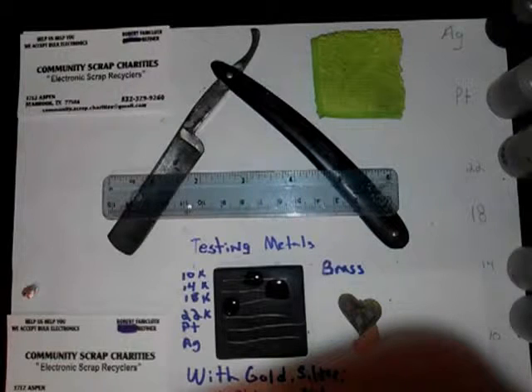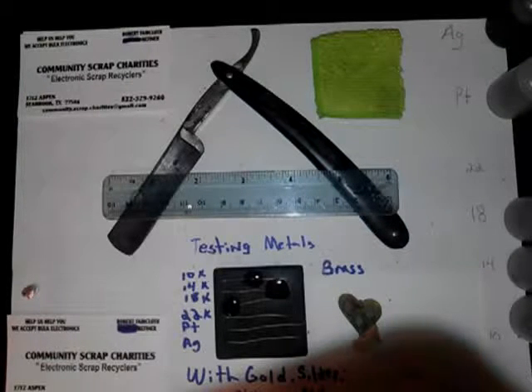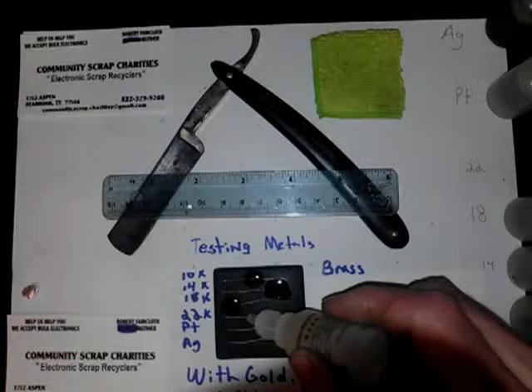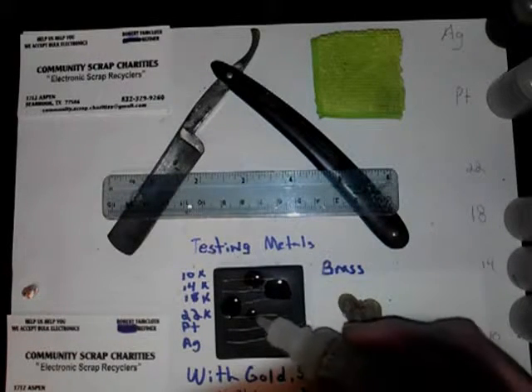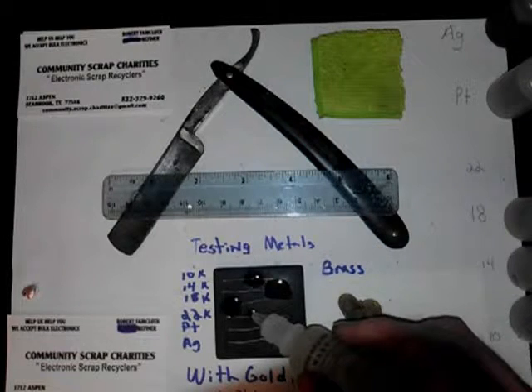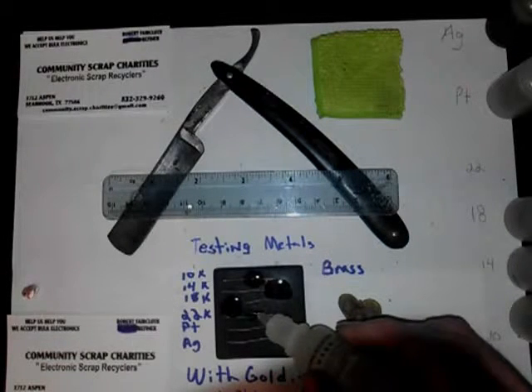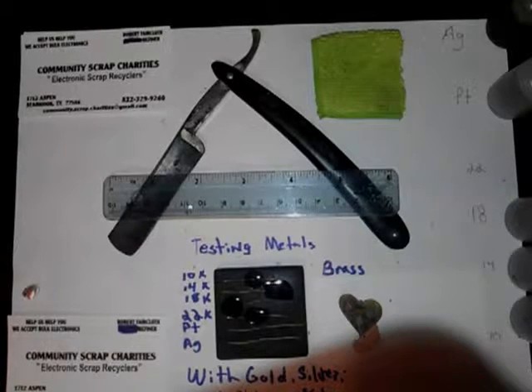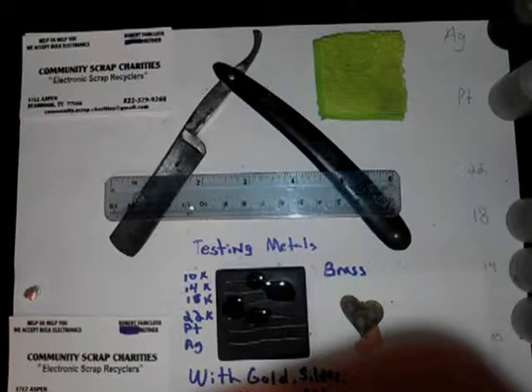18 tears it up. 22. 22 does not do much of a reaction.